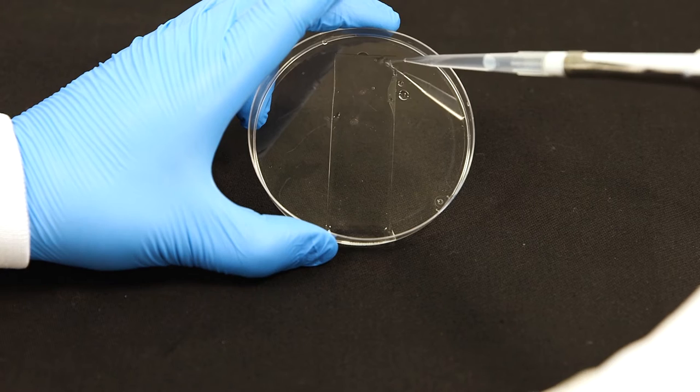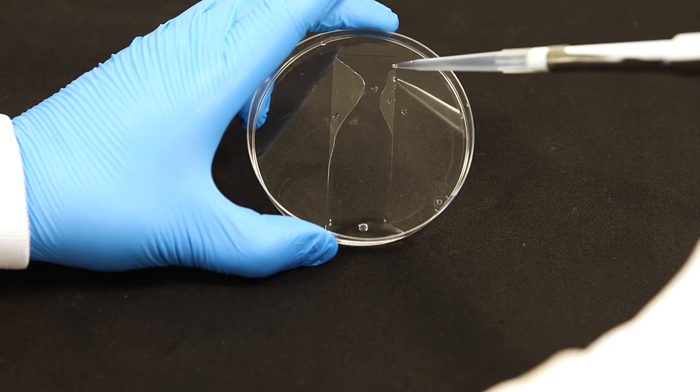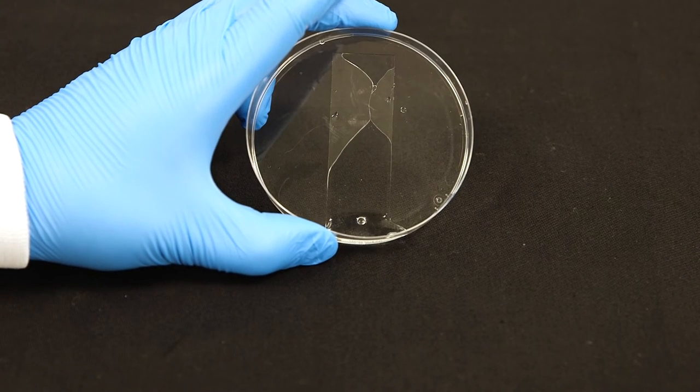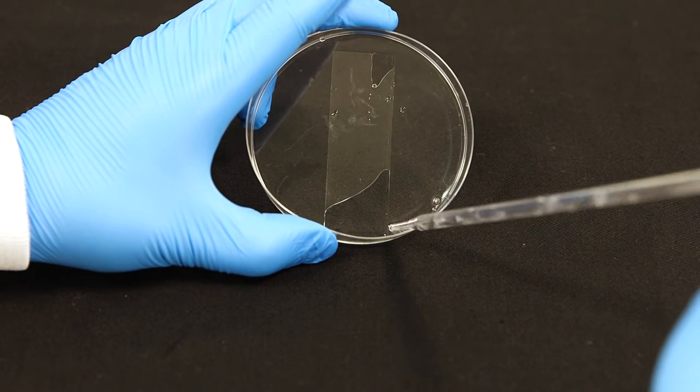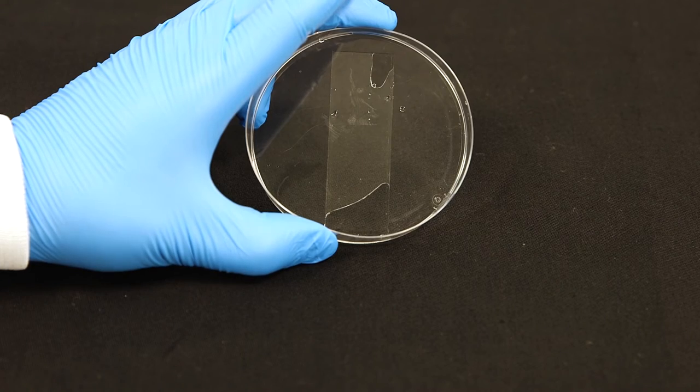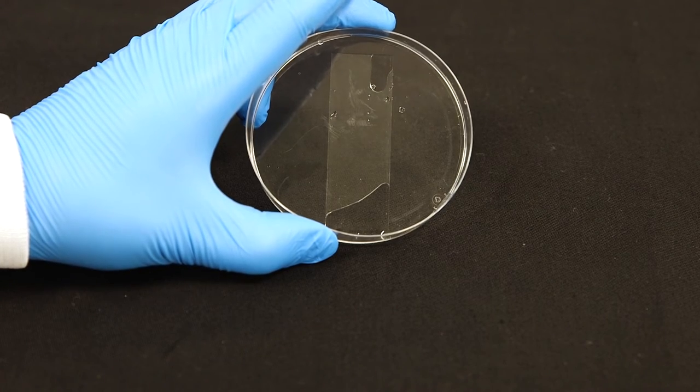Then, wash away any cells that have not settled into wells by tilting the Petri dish and adding 1 milliliter of suspension buffer to one end of the chip. This step can be repeated if unsettled cells remain on the gel surface after inspection under the Brightfield microscope.